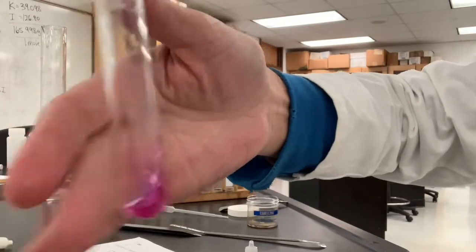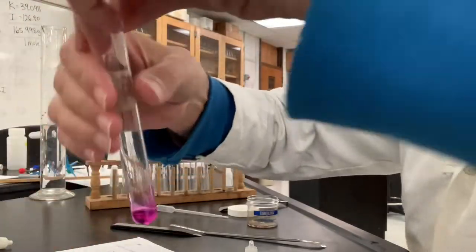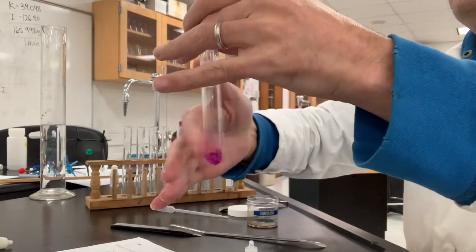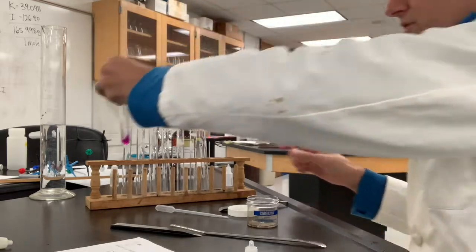You can see a small amount of solid on the bottom of this test tube, but it hasn't finished doing its thing yet. We'll come back at the very end and observe these one last time, but you can make your guess as to whether it dissolves or not.